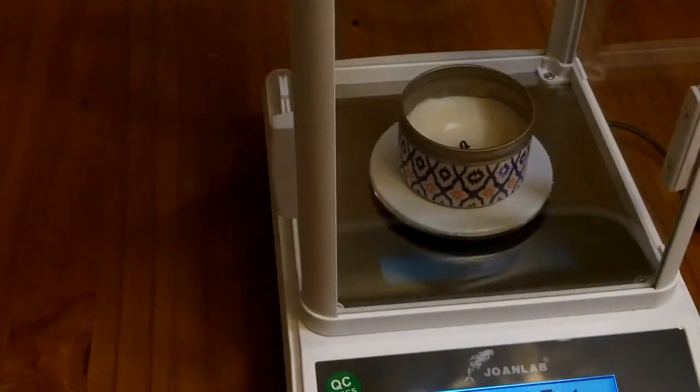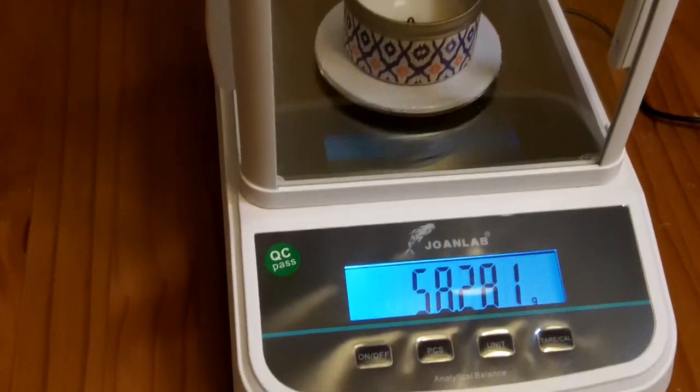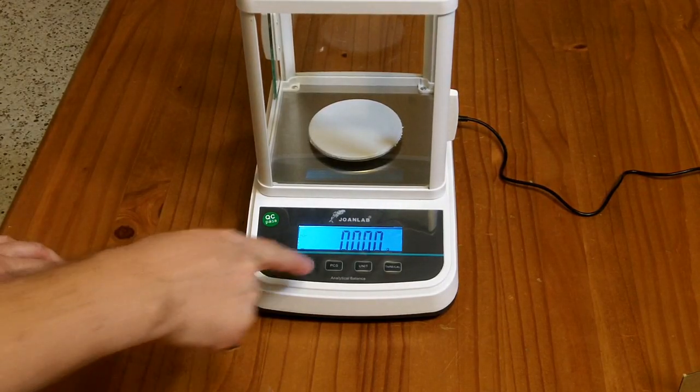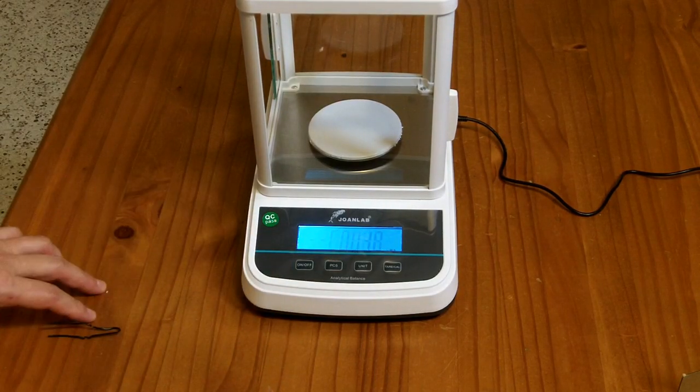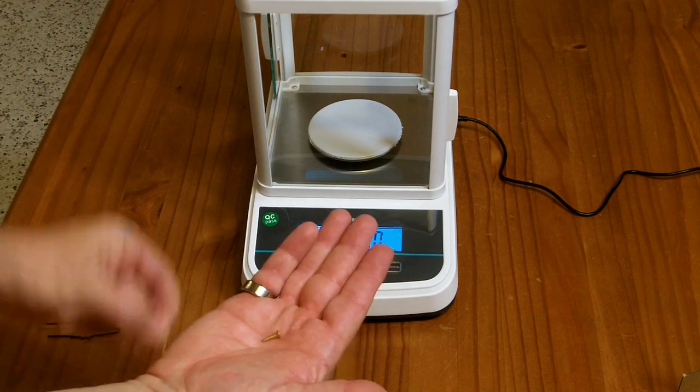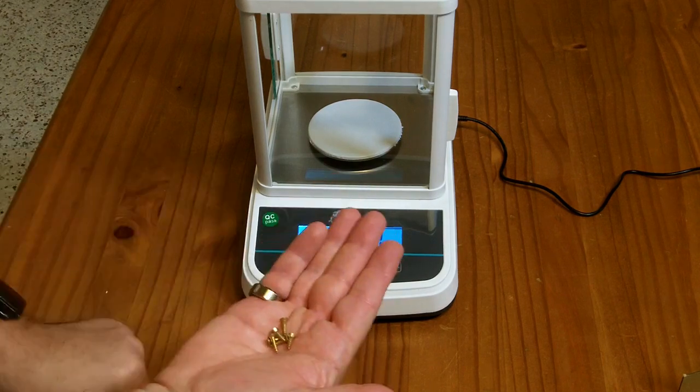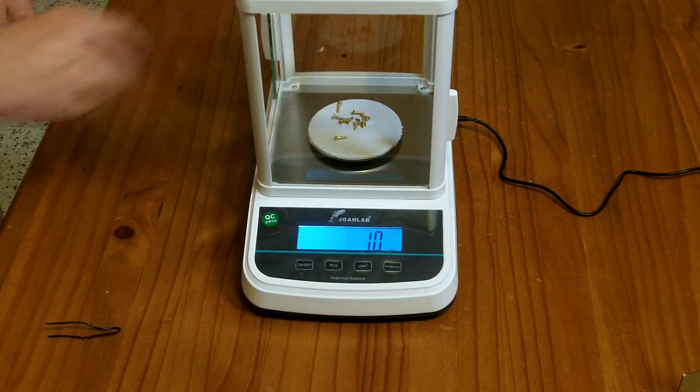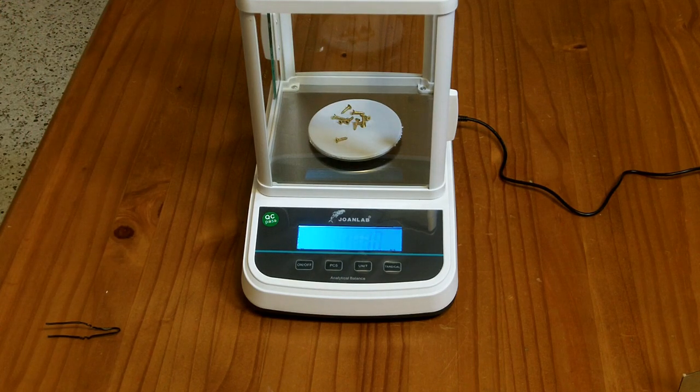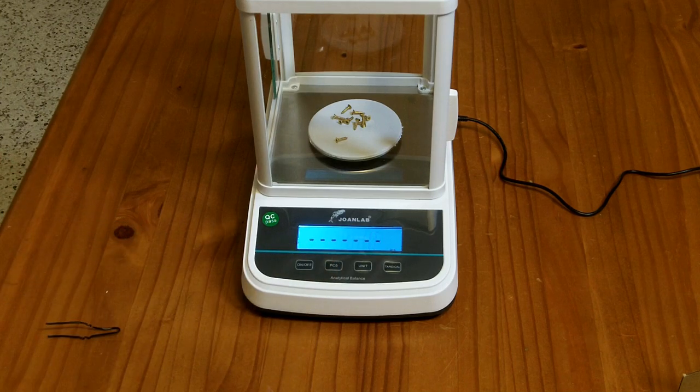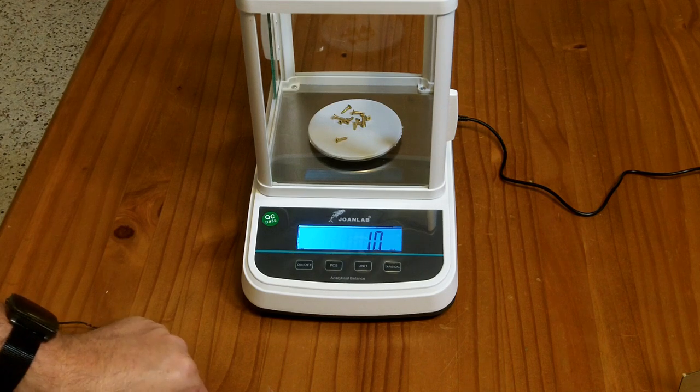So essentially, if I burnt this candle for about one or two seconds, we could have seen a change. Now it also has a count by weight mode. So you hit the pieces button and it says, hey, put 10 pieces on the scale. So you do have to count 10 initially. Then you press pieces again. Thinks about a little bit. And it says, oh, there's 10 on the scale right now.